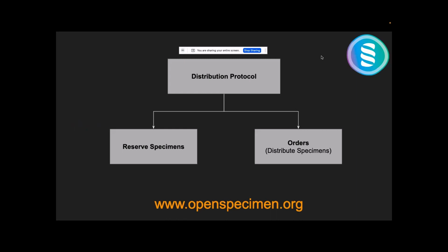So we will see what an order is. Within that, there are two primary ways you can do it. First is reserving specimens, and second is directly distributing the specimens. From one or two of the use cases, I learned that many times a researcher requests some specimens, and it takes around 1 to 3 days for internal approval, and then you send it to internal labs and then proceed.